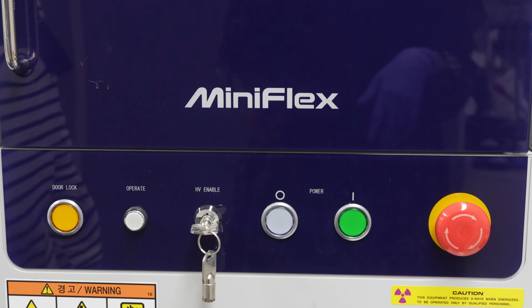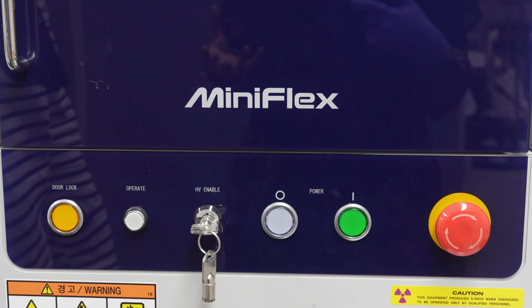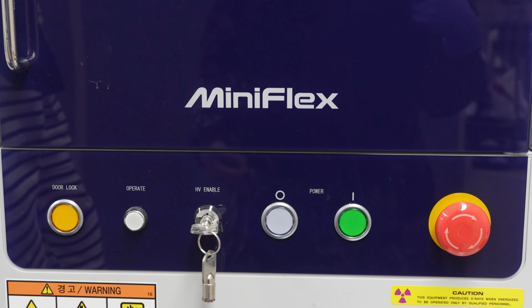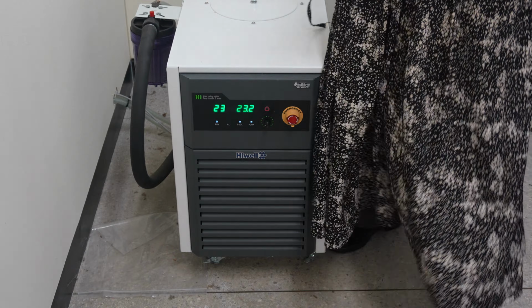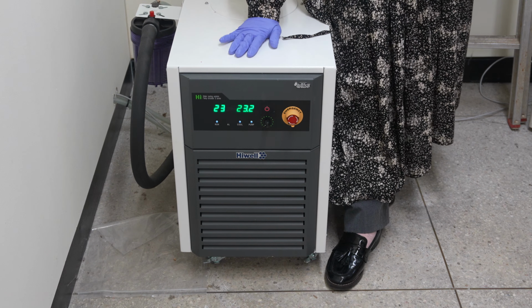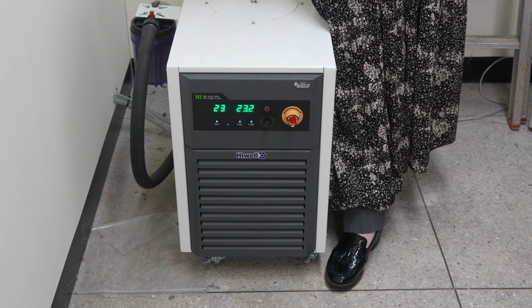So remember, we still have the chiller, and then we need to wait for about 15 minutes before we turn off the chiller. This is to make sure that our machine is fully cooled down. After 15 minutes, now we are ready to turn off the chiller because the temperature of the machine is now stabilized.